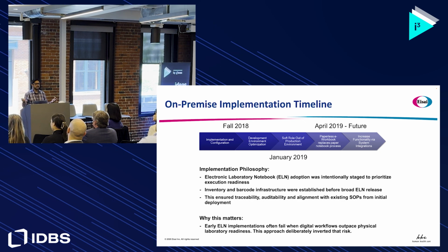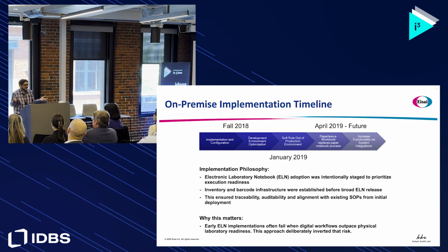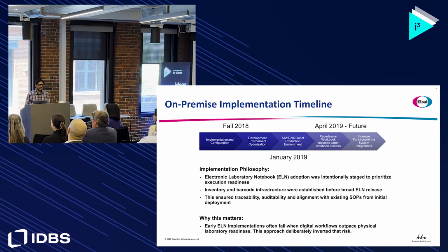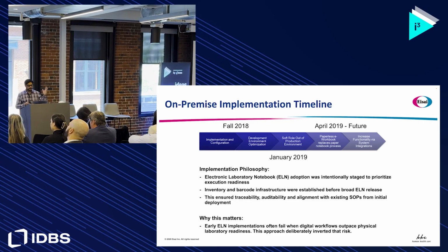Everything that we do in the lab is reagents, equipment, samples, that's it. Those are the three main pillars in inventory, right? So it was a natural fit.